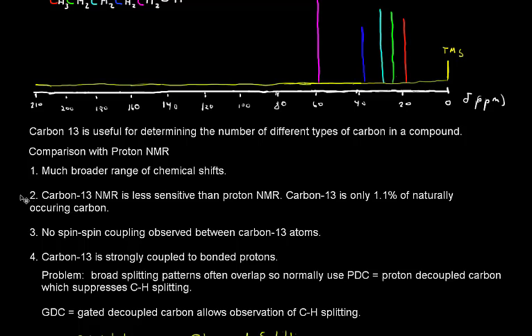And so that's one reason why carbon-13 NMR is less sensitive than proton NMR. Another reason is that the carbon nucleus itself is not as magnetic as a proton. So for those two reasons, carbon-13 NMR spectra typically take much longer to run than proton NMR, given the same concentration of sample in the NMR tube. Sometimes we set up carbon experiments with many more scans, many more pulses of RF radiation than proton NMR, to get a decent spectrum.